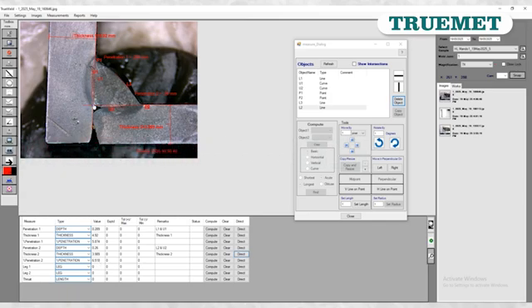For leg 1, this intersection point and this point P1. So here going to compute leg 1 also, that is I1 to P1, find. Similarly leg 2, that is I1 to P2, find. Similarly throat measurement, I1 to L3, find. So all our measurements are done.